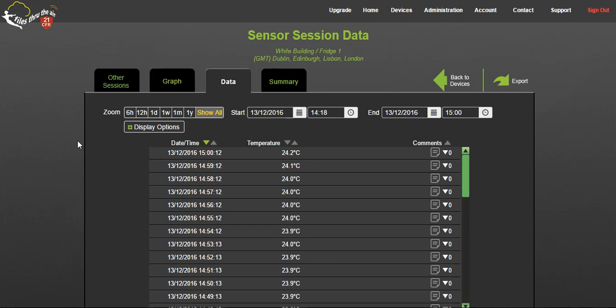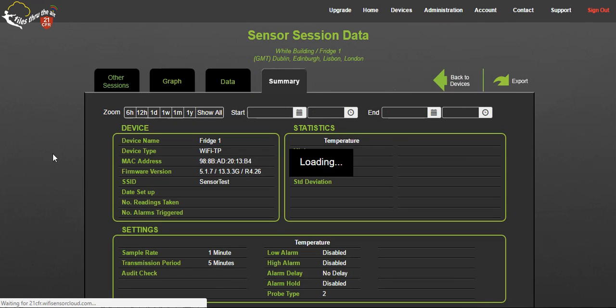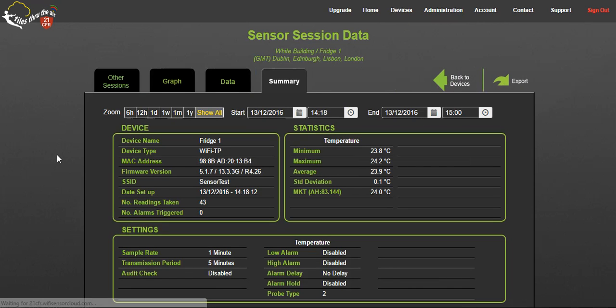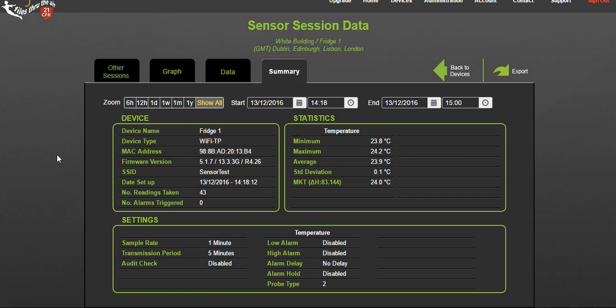The summary button to see an overview of the whole session including max, min, average and standard deviation data, settings and specific device data.